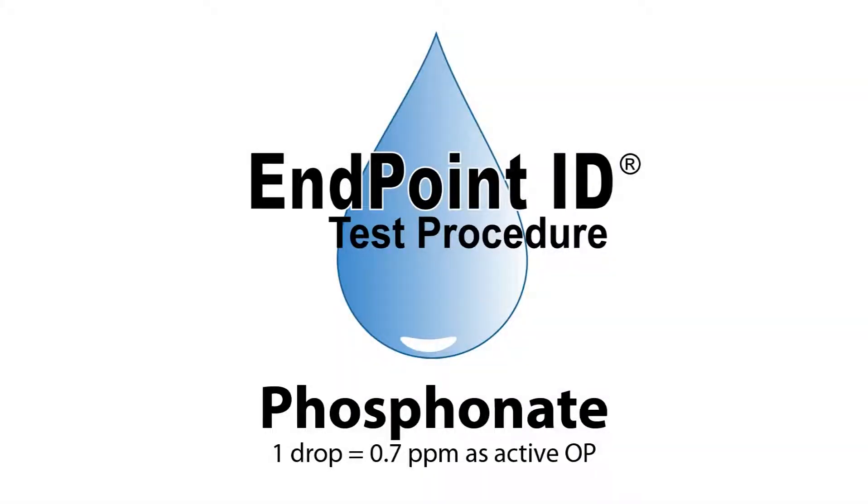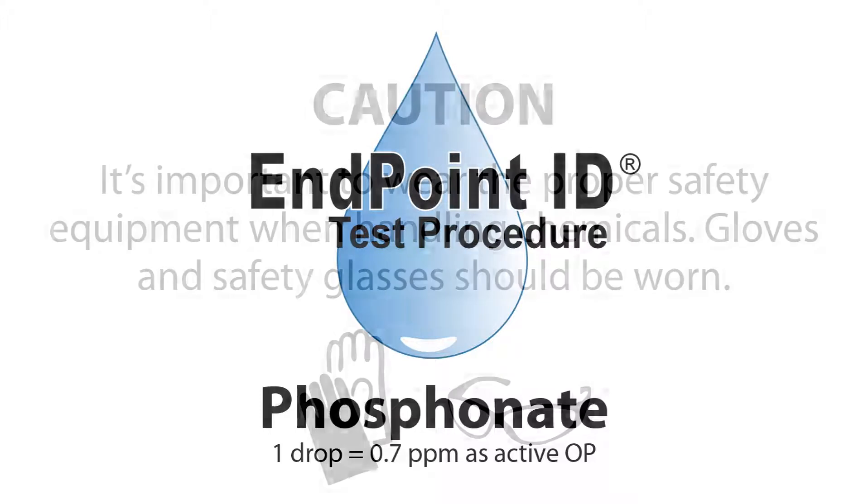This is a demonstration of a Phosphonate Drop Count Test Kit using Endpoint ID procedures.